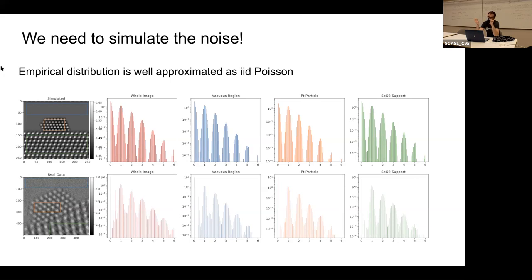Because it has to look around and figure out how to use the rest of the noisy pixels to estimate that particular pixel. If the noise is independent, this forces the network to denoise. That's called blind spot denoising. Again, this is not the focus here, but well, sorry.